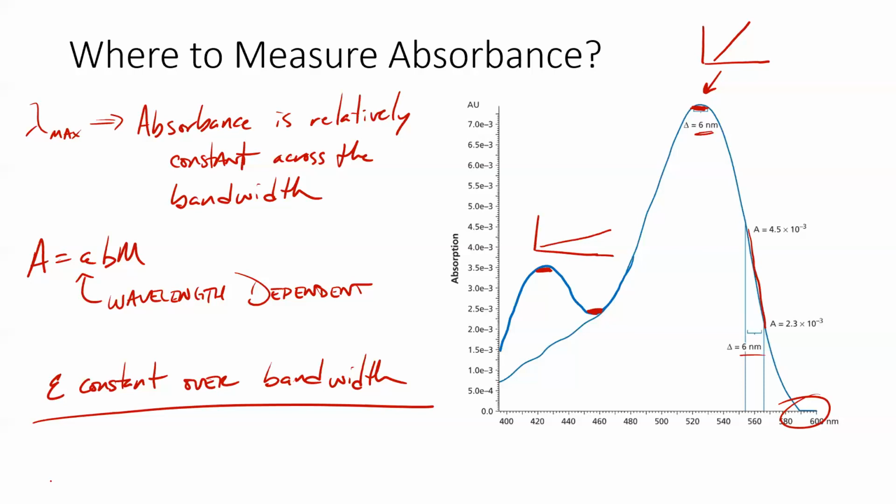All right. Moving on to the good stuff. This is the part I like the most. So I'm going to draw what's called a box diagram. This is a diagram of boxes. Excellently named, I know. And these are very simple schematics that I expect you to be able to reproduce.